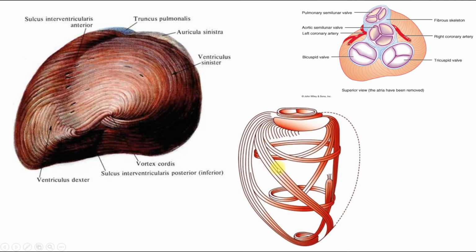Here we can see cardiac muscular tissue. There are intercalated discs, anastomosis between neighboring cardiac myocytes, the anastomosis and branching structure, intercalated discs, and transverse striations inside the cytoplasm of cardiac myocytes. And here we can see direction of functional muscular fibers inside the heart muscle, but those functional muscular fibers are composed of distinct cells which are called cardiac myocytes.